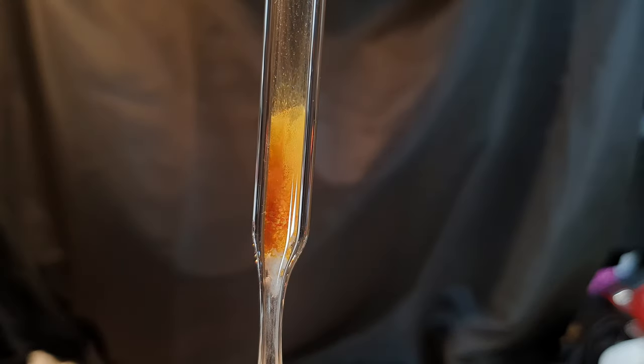At the moment only oxygen is flowing through the vial. As soon as I turn on the ozone generator, the superoxide reacts with the ozone to form cesium ozonide. As the ozonide is formed, you can see the color change from yellow-orange to red.